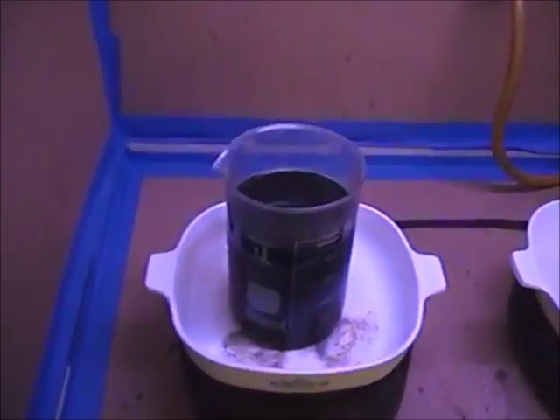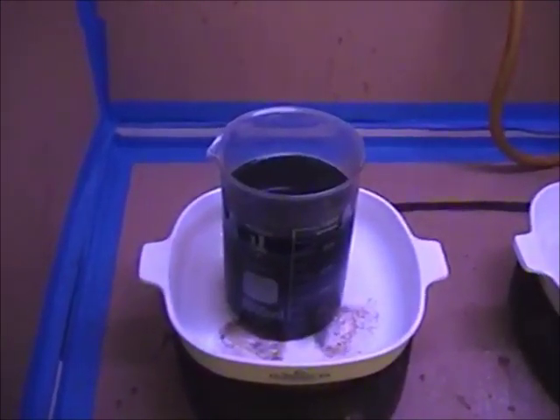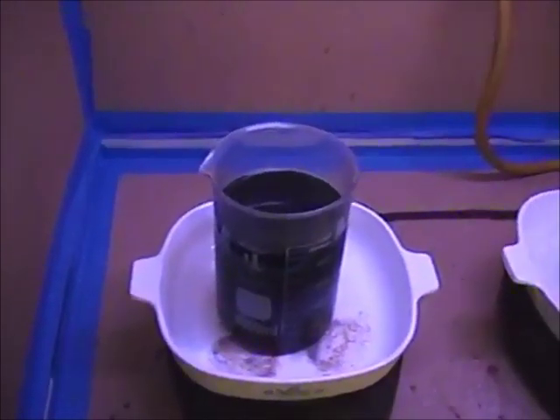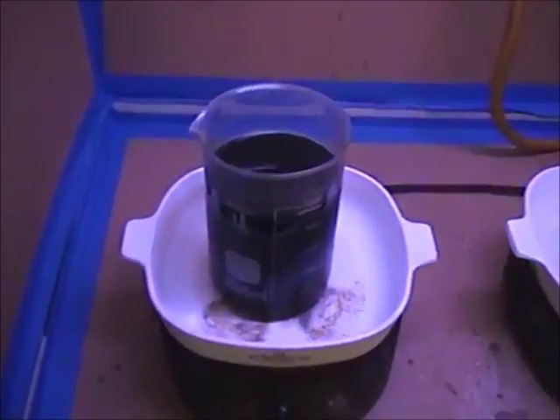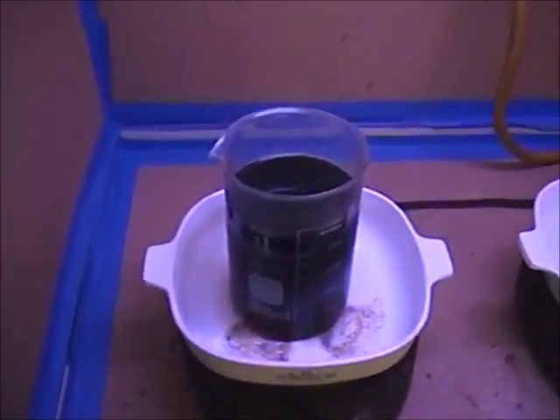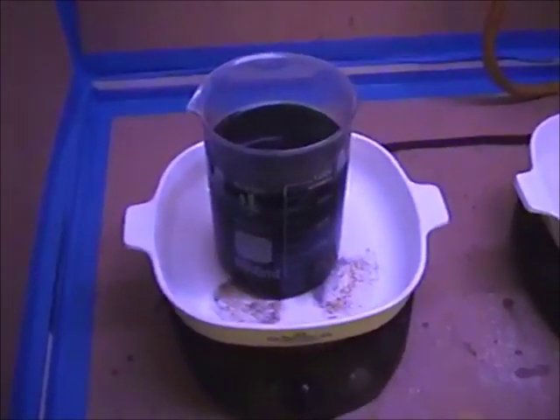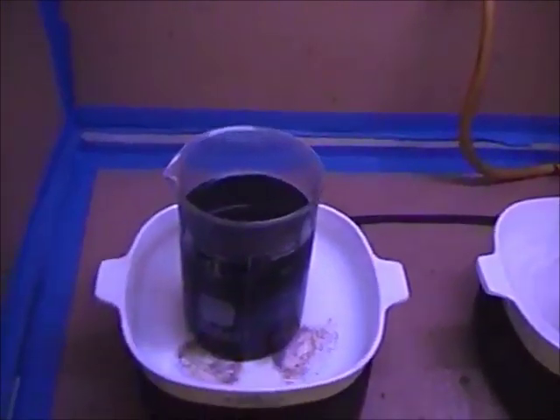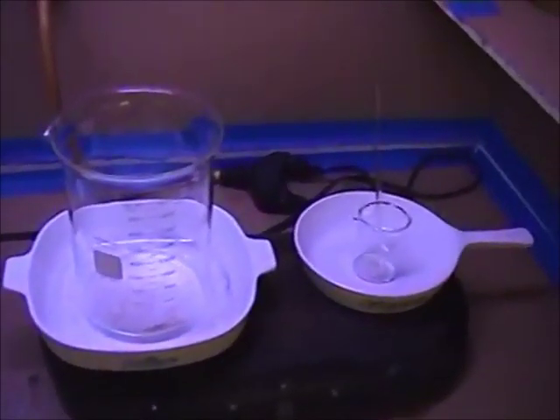Now, there'll come a point when our solution starts testing negative for silver. Then we'll know that we're done. Until then, we'll add sodium formate to reduce it. And like I said before, with the sodium formate being a selective reducing agent, if we use it in excess, we don't risk dragging down copper. The only thing we should really be concerned with is our washing procedure after precipitation. That will be a very important step to remove any of the contaminants that may still be left in this solution. Now, I think I've pretty much covered everything for now.